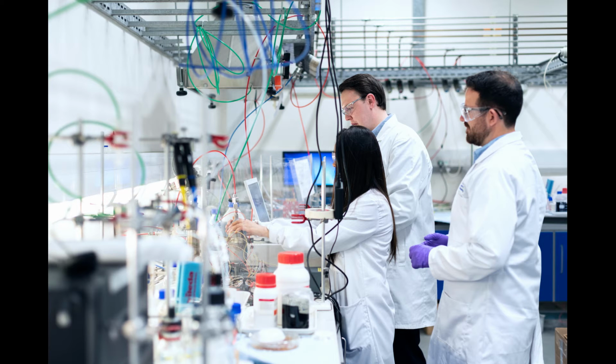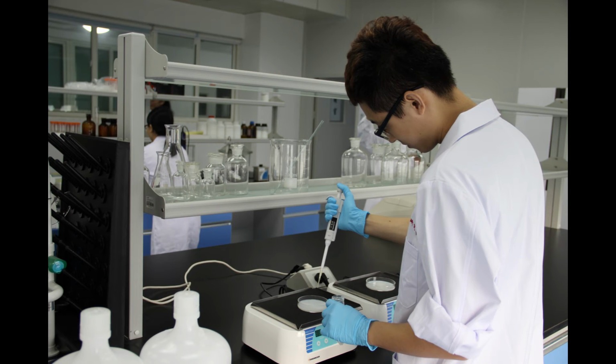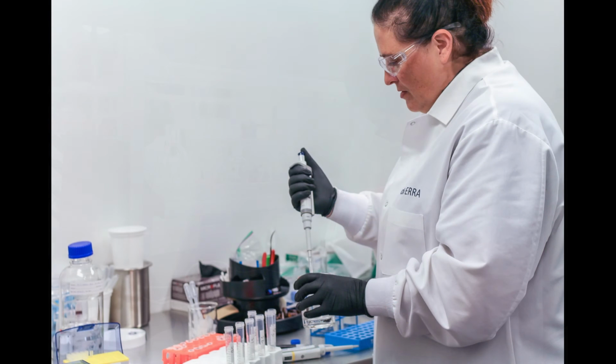The minimum requirements. The facility itself must have the basics available as well, this being a sink for washing your hands, and a door which separates the laboratory from the rest of wherever it's located. Working within the laboratory generally has a few rules associated as well. You can only use a mechanical or electronic pipette. In some instances, other laboratories would allow the use of a mouth pipette. This is a rather obsolete practice, but in some instances applied. Things like sharps should be handled appropriately and disposed of appropriately.